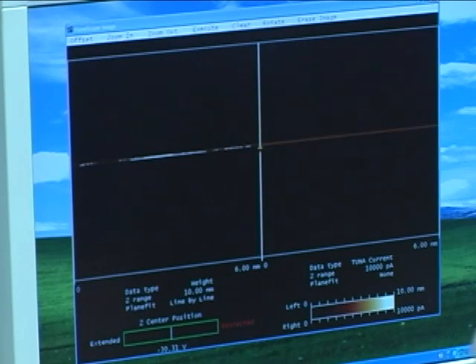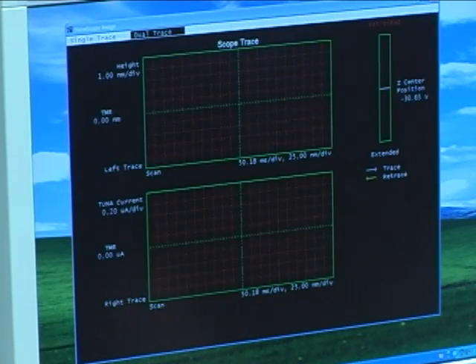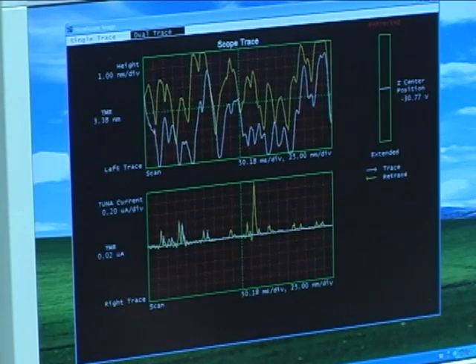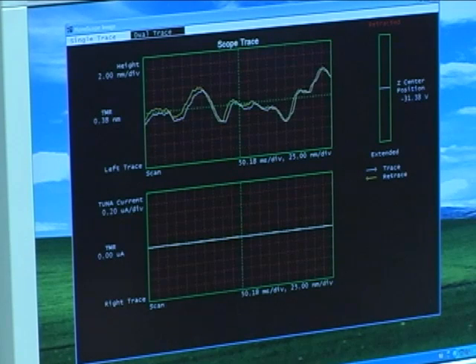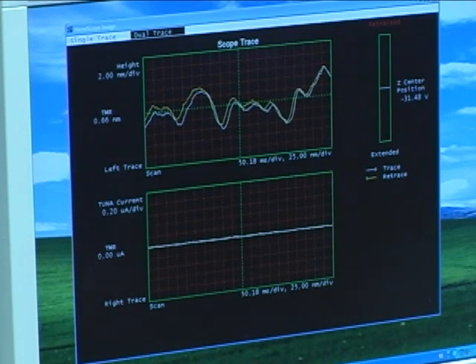So we'll just scan 500 nanometers squared. And about half a hertz. Go ahead and adjust my gains. I'm just adjusting my gains to try and get what I consider the best overlap between the trace and the retrace of the tip without introducing too much noise.